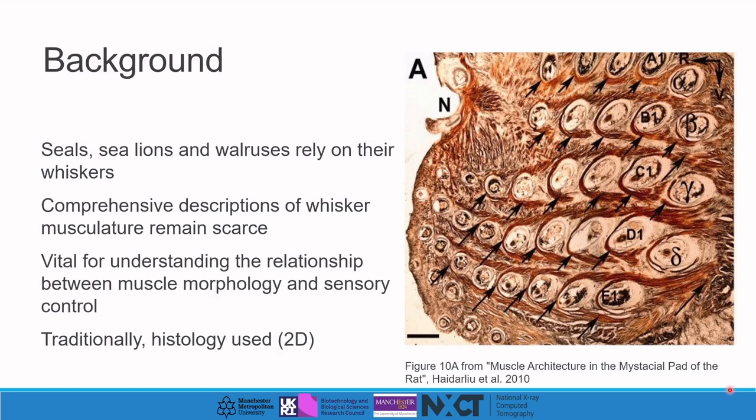Pinnipeds are much larger mammals with more curved mystacial pads. Another drawback of histology is, of course, that it is destructive, meaning that studying museum specimens with this method is not possible if the samples must be returned to the collection undamaged.